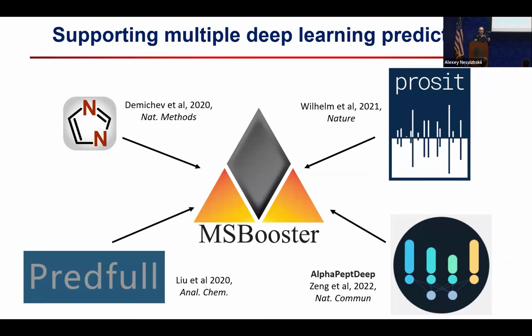not the whole data set, and test all models that are available on Koina. And then we find the one that, for the particular data set we're analyzing, gives the best similarity and the best retention time agreement. And then for the full analysis on all data, we use that best model. So we basically created this easy-to-use infrastructure for finding the best prediction model. So even if one predictor doesn't work well on a particular data set, probably another predictor from another tool would work better. So that improves the robustness.